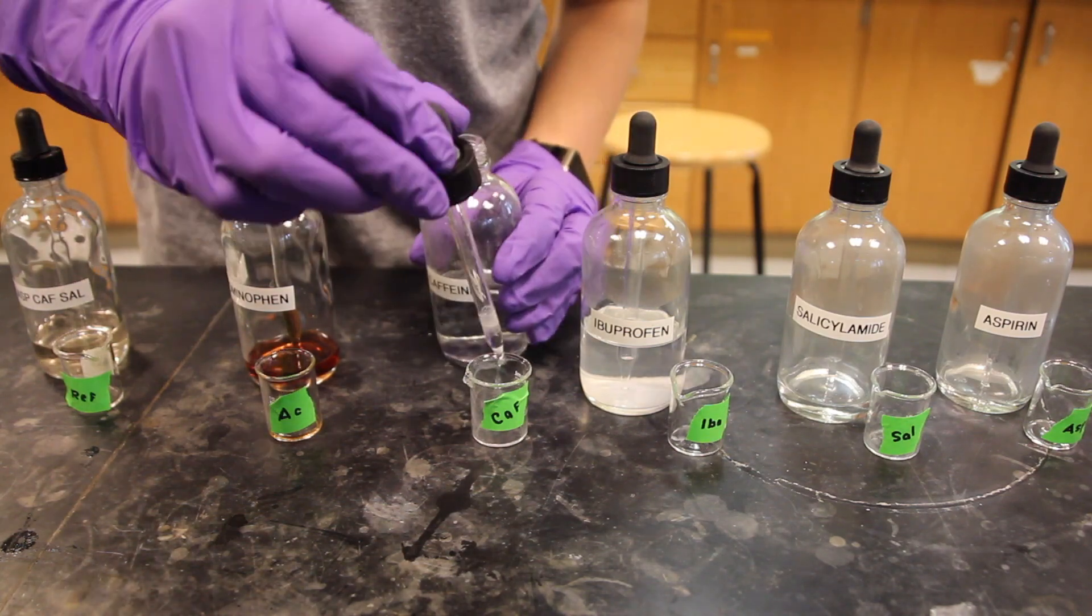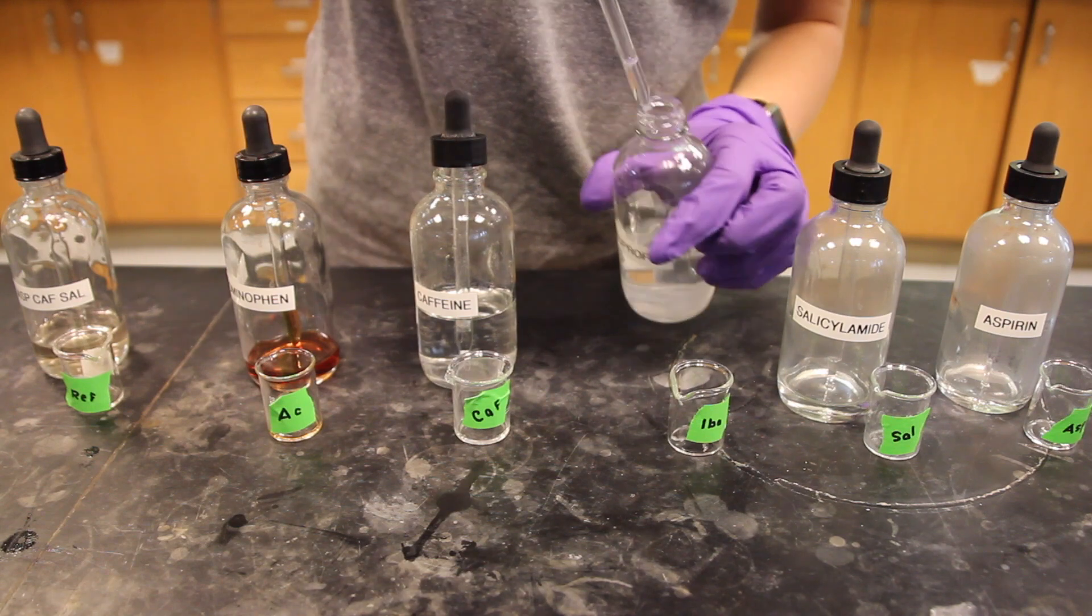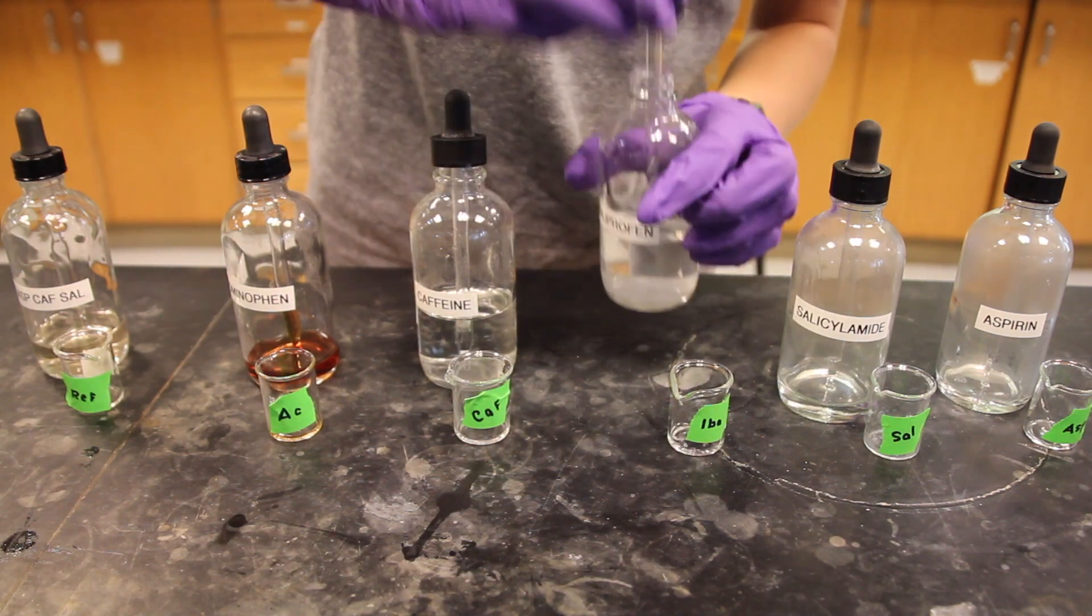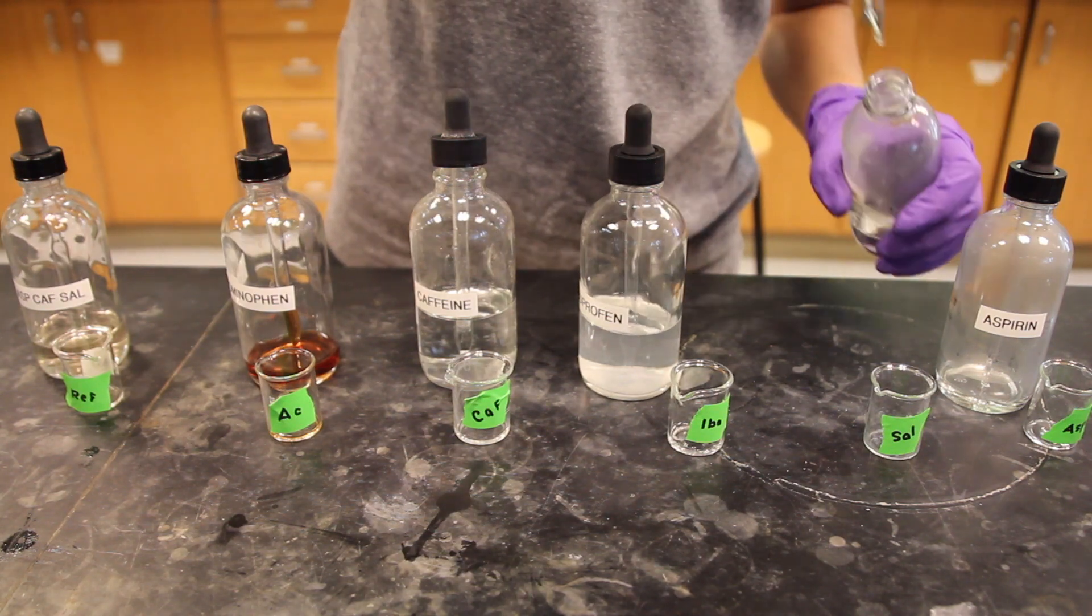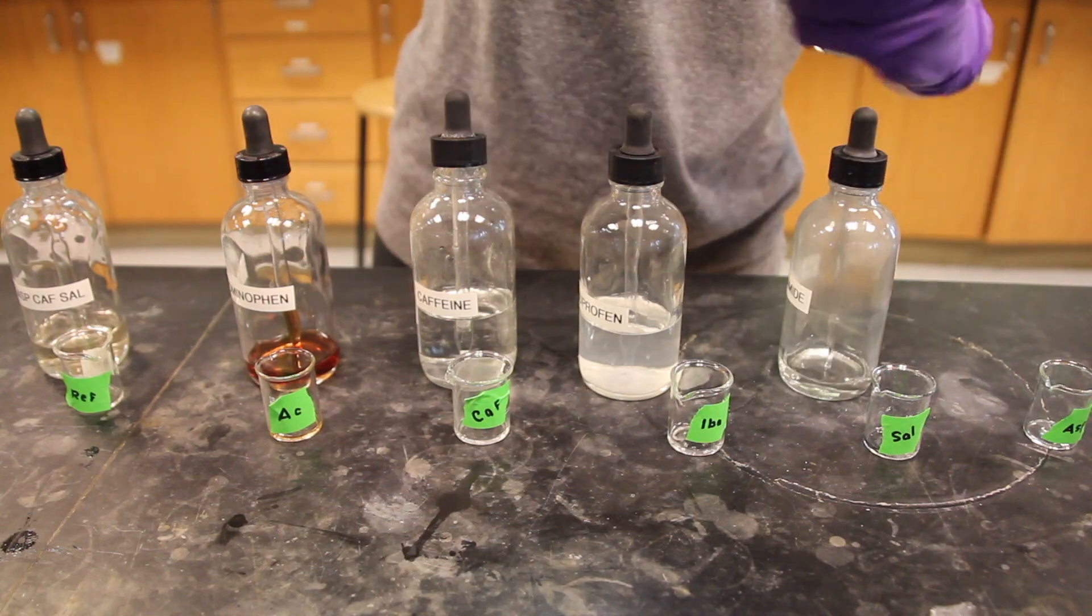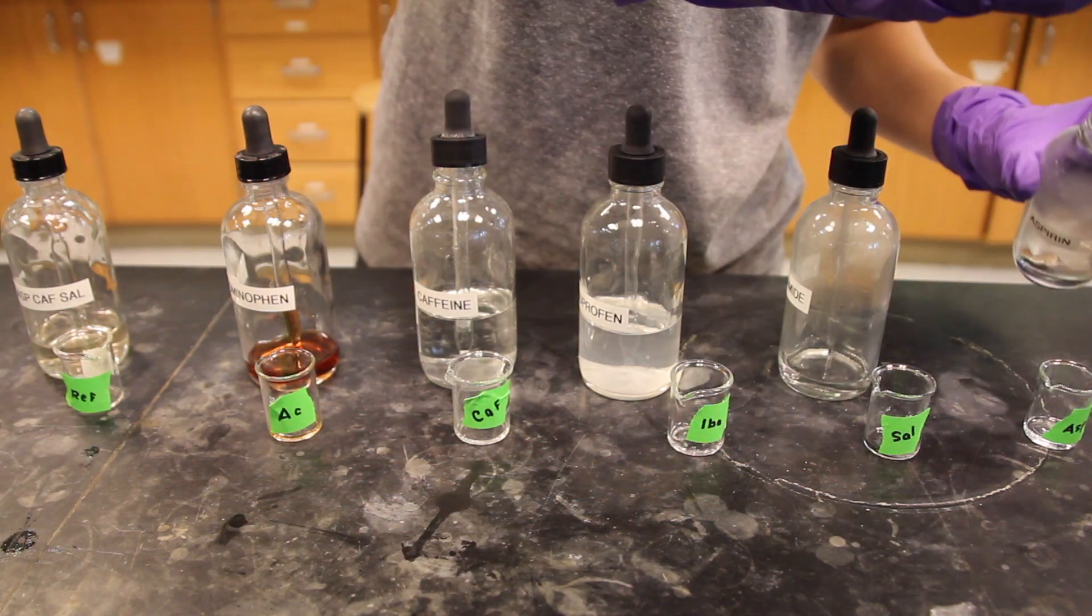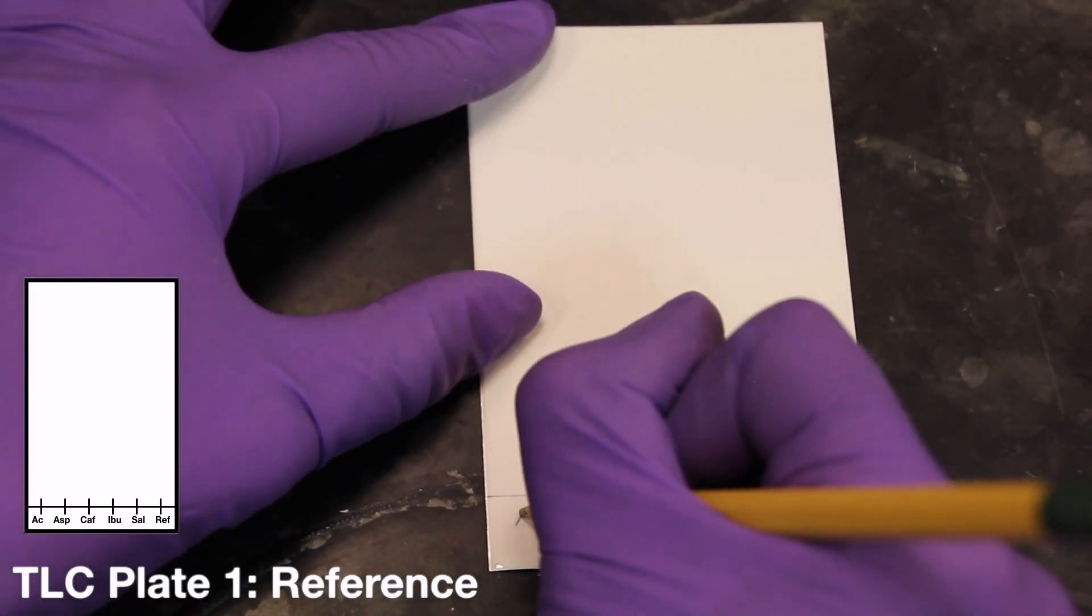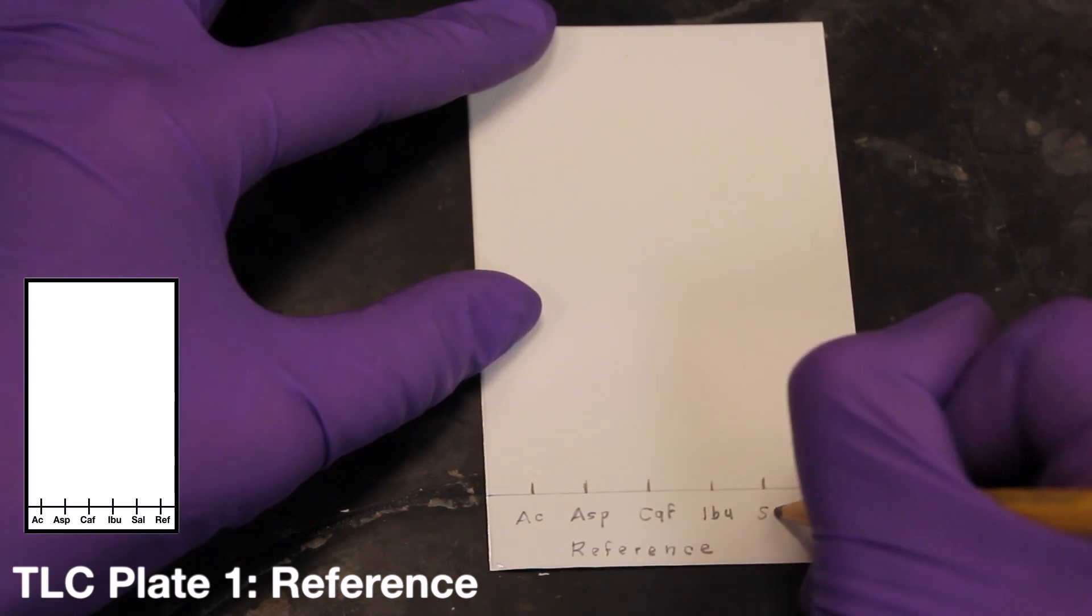Ibuprofen is not included in this mixture because its RF value is very close to that of salicylamide under the chromatography conditions that we use here. Obtain a few drops of the known reference solutions in labeled 10 mL Erlenmeyer's or beakers. Share these solutions with other students in the lab, as each person only needs a very small amount. It is helpful to apply the compounds in alphabetical order to minimize the chance of confusion: acetaminophen, aspirin, caffeine, ibuprofen, salicylamide, and finally the mixture.